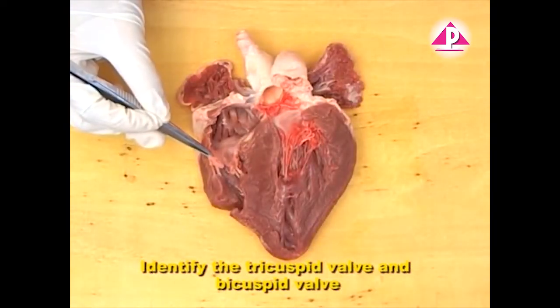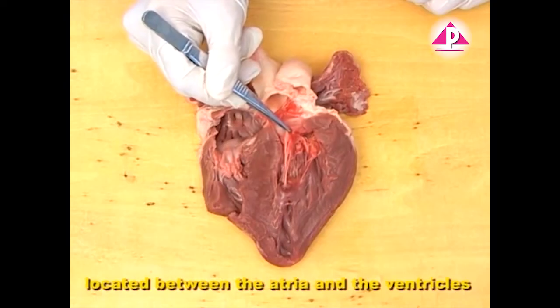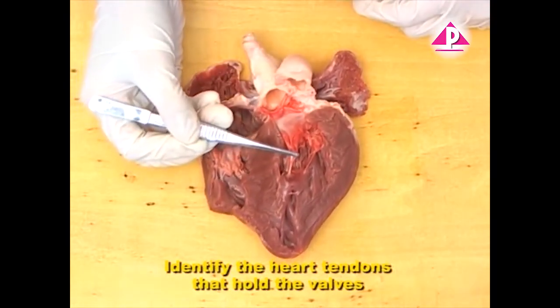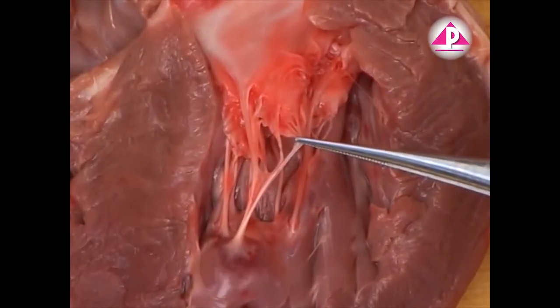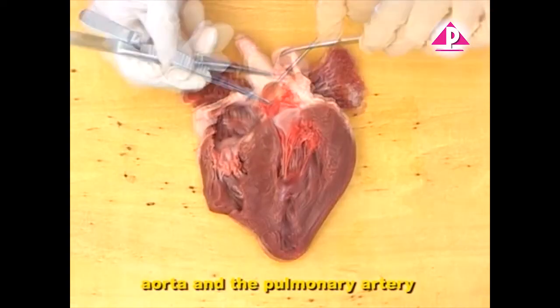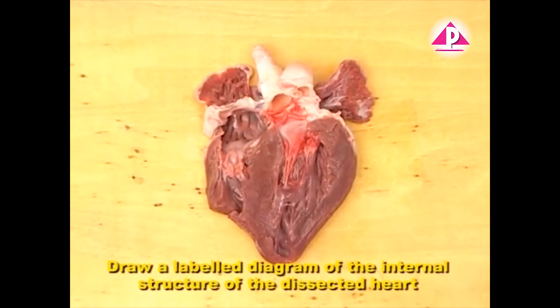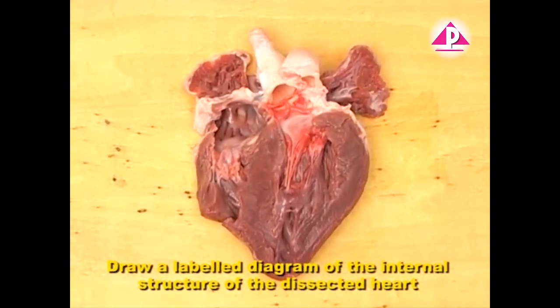Identify the tricuspid valve and bicuspid valve located between the atria and the ventricles. Identify the heart tendons that hold the valves. Identify the semilunar valves at the base of the aorta and the pulmonary artery. Draw a labeled diagram of the internal structure of the dissected heart.